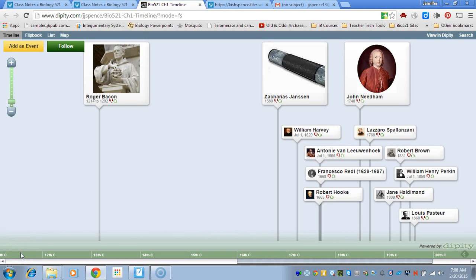Okay, this video lesson is to go over some of the material that we covered in terms of the development of the microscope and different types of microscopes. We'll use the timeline that was created to touch back to the different people who helped contribute. There are more people, but we're focusing just on a few of them.